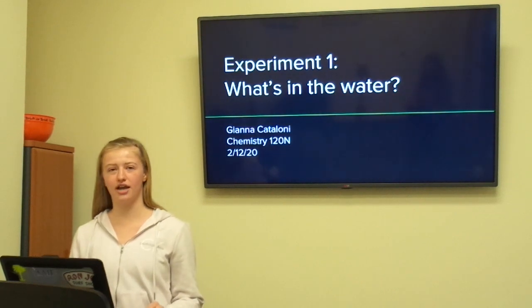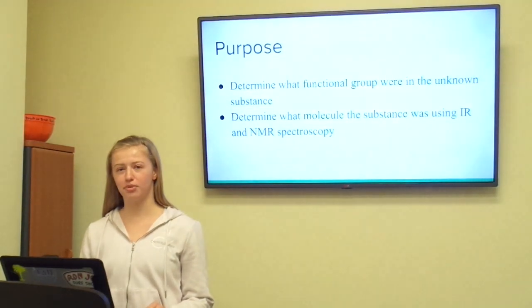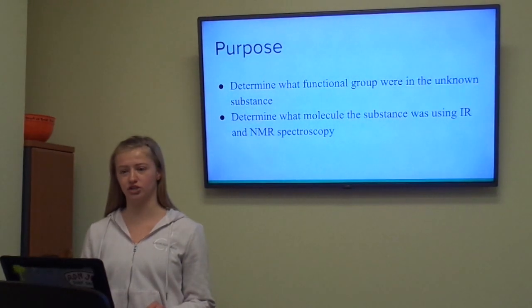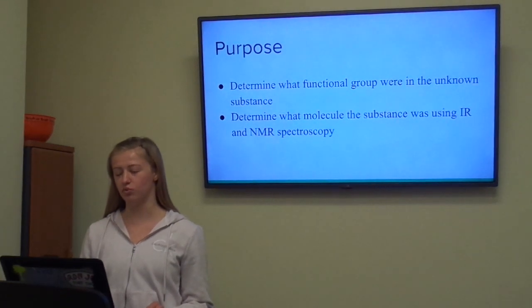My name is Gianna Cataloni, and this is Experiment 1, What's in the Water. The purpose of What's in the Water was to determine what functional groups were in the unknown substance and then to eventually determine what molecule our substance was. IR, infrared spectroscopy, and NMR, nuclear magnetic resonance spectroscopy, were used in order to determine what the substance was.